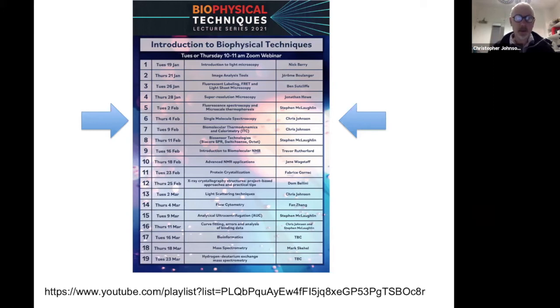So today's topic that I'm going to try and cover at some level is on single molecule spectroscopy.